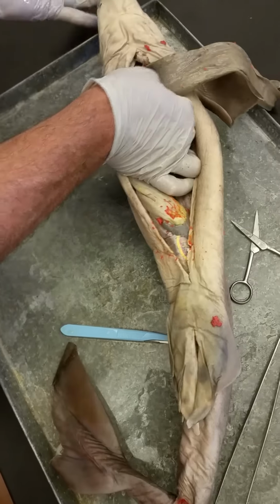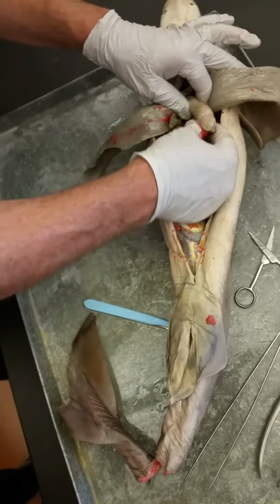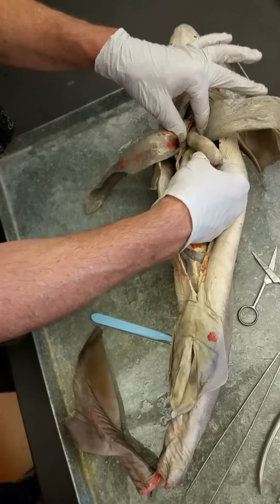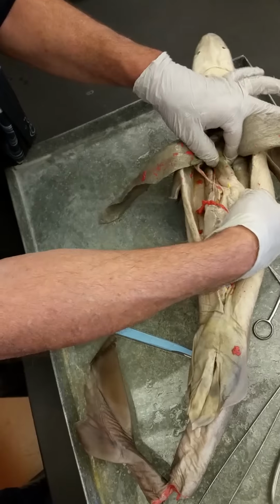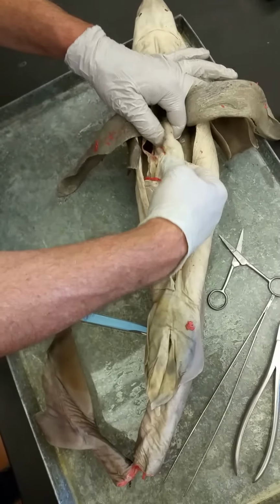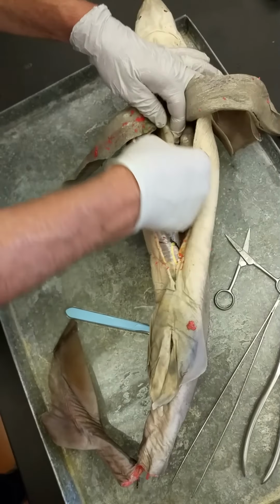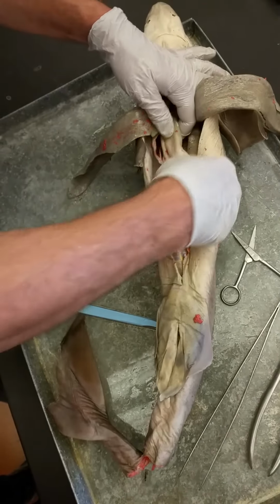We then come from the pharynx into the muscular stomach. The stomach again folds back like we saw in the bony fish, so it folds backwards and then down to the intestine.